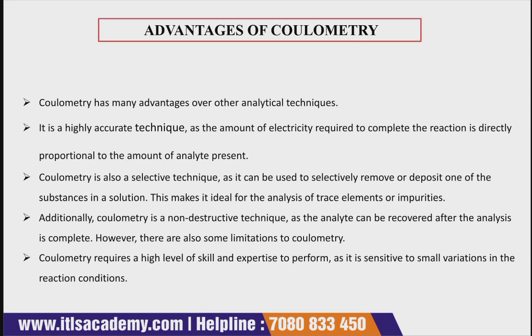Now comes the advantages of coulometry. As already told, coulometry has many advantages over other analytical techniques. The first advantage is that it is very highly accurate.